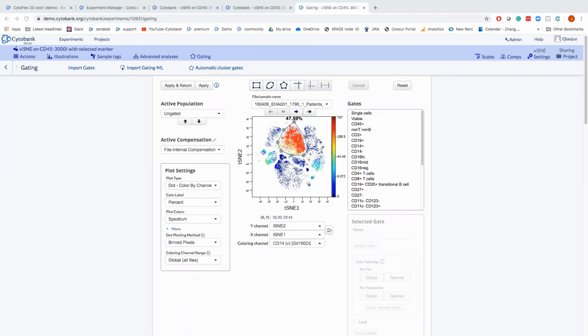Perfect, thank you so much. And I'm going to get Sarah to answer this question, which is, can the plots be exported as vector files? Yeah, so we have a few different ways that you can export plots out of Cytobank. You can export them as SVG files, and I believe that's just by, and Steph and Chinjun, right-clicking on the plot to save it as an SVG file, but it is available out of Cytobank. Perfect, thank you very much.